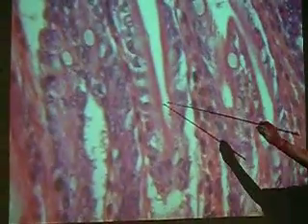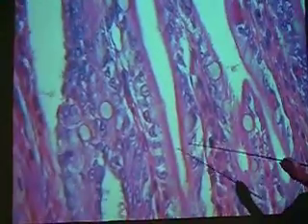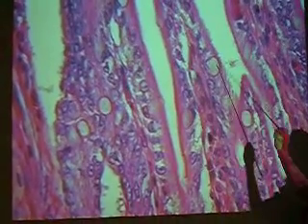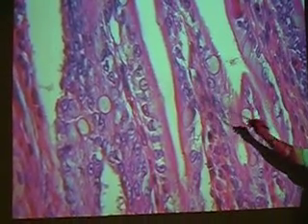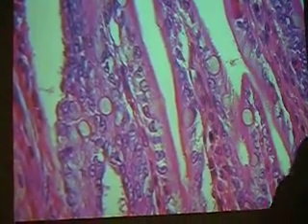It's not great. I'll have to look around and get you guys some good epithelium. But it's supposed to be simple columnar with microvilli, and what kind of cells? Goblet cells, yeah. It doesn't look real tall there, but it's supposed to be simple columnar with microvilli and goblet cells. That forms the edge of the villus with the lamina propria inside.